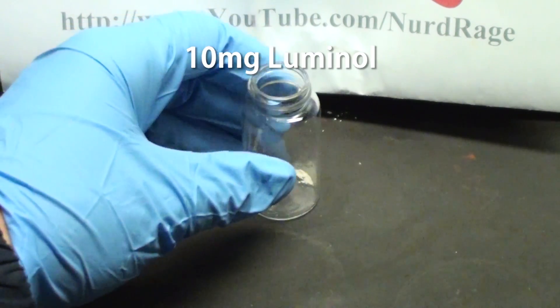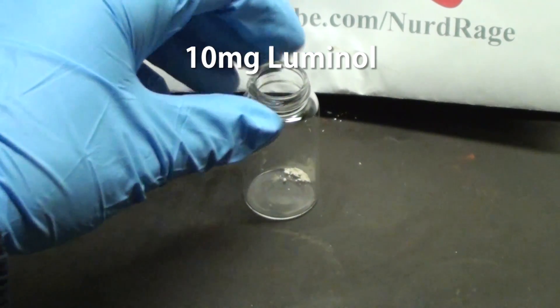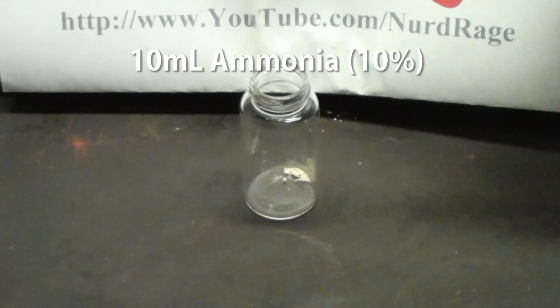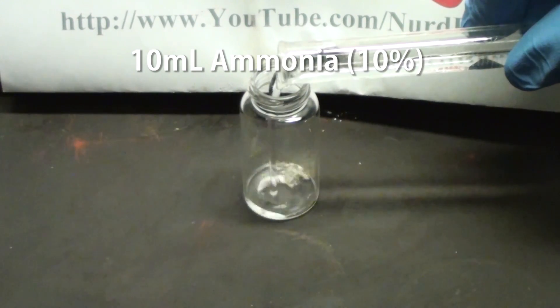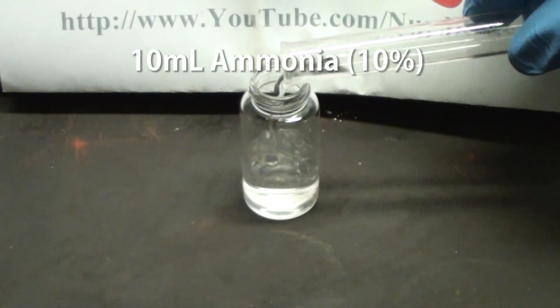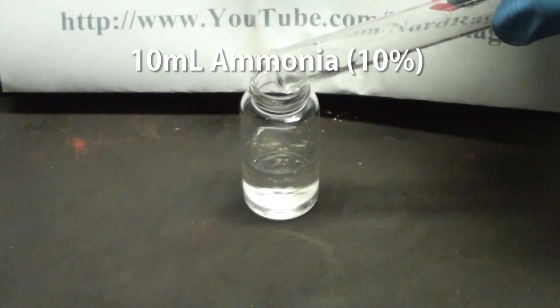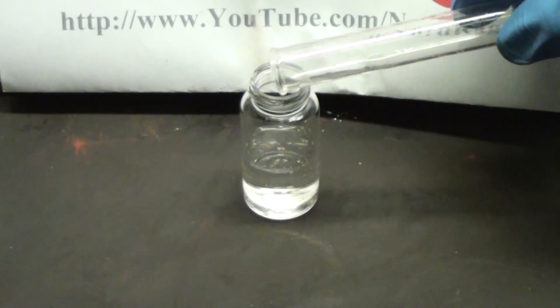First we make the solution. Get about 10mg of luminol and add to it 10mL of a 10% ammonia solution. The exact concentration doesn't matter.